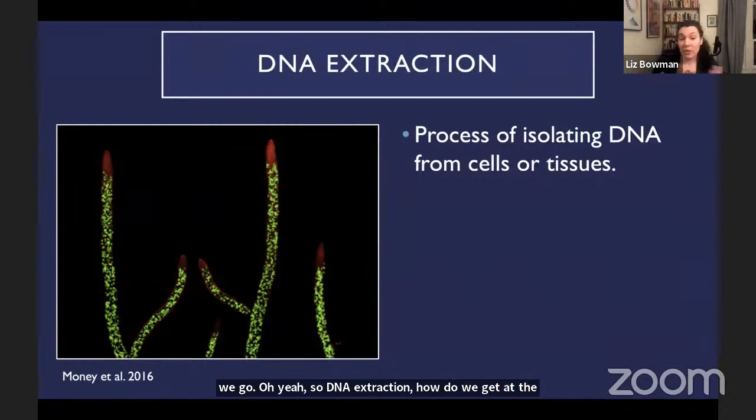So DNA extraction, how do we get at the DNA? DNA is within the nucleus inside cells, and you have to break open the cell to access the DNA. If you just try and copy DNA without opening the cell, it's not really going to work.